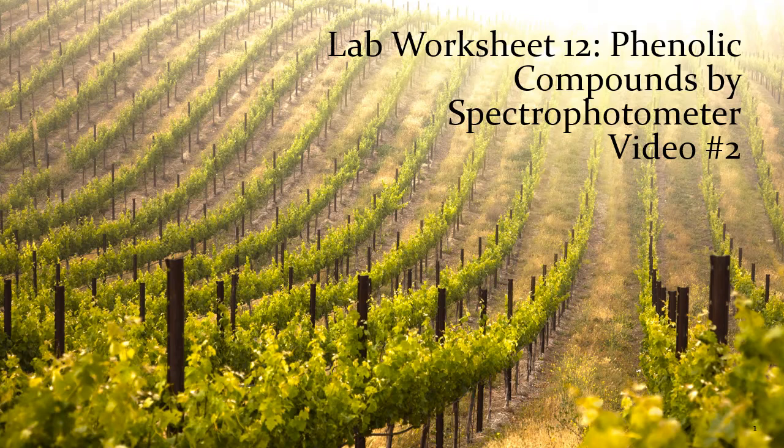We're talking about testing phenolics by Spectrophotometer. Video 1 was mostly background. Let's get into the experiment.